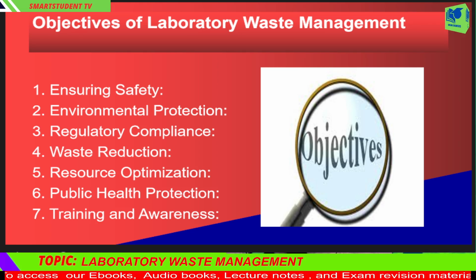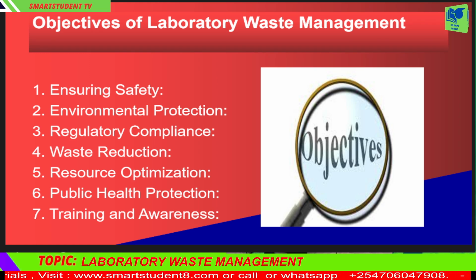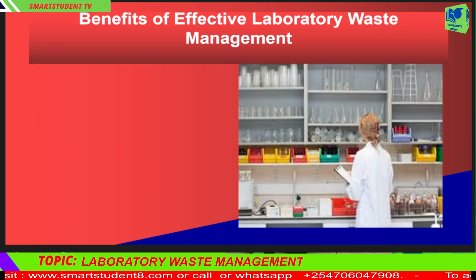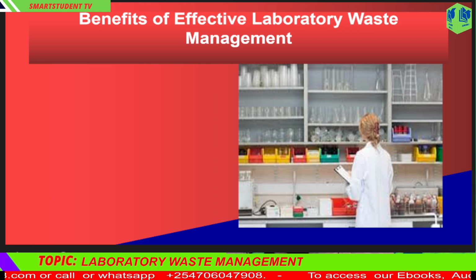Moreover, adhering to waste management protocols ensures compliance with local and international regulations. Laboratories operate under strict guidelines from bodies such as OSHA, Occupational Safety and Health Administration, and the EPA, Environmental Protection Agency. Failure to meet these standards can result in hefty fines, legal battles, and, in extreme cases, shutdowns. Benefits of effective laboratory waste management. When laboratory waste is managed properly, everyone benefits: the staff, the institution, and the environment.